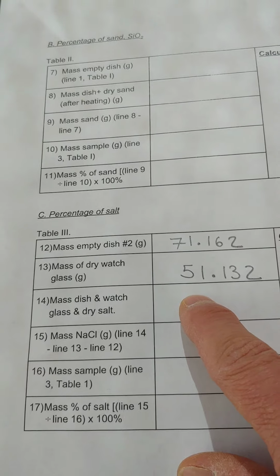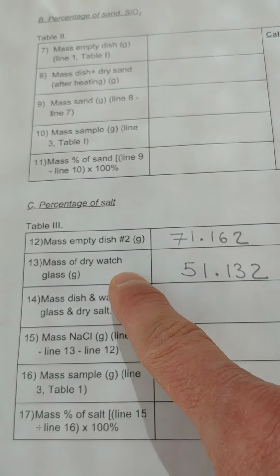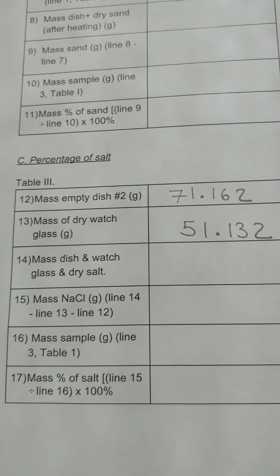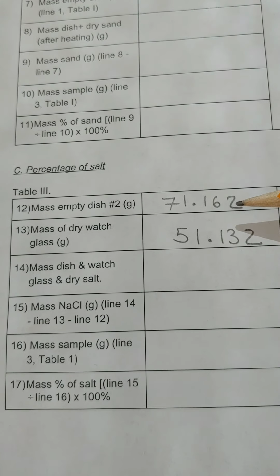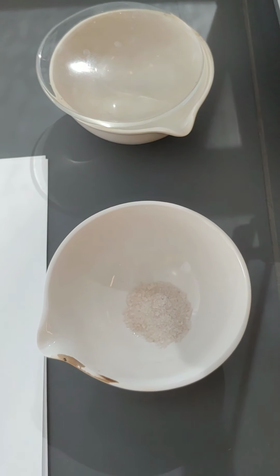When I evaporate the salt off, I want to make sure I have the watch glass on top, because this sample tends to splatter as it's evaporating, as the water starts to boil, and I don't want any of the salt being lost from the container. I want to make sure it all stays in, so essentially the watch glass just acts as a lid to keep all the sample inside. So I'm going to go ahead and start that process of adding the water, pouring it off into the second dish, and then repeating that process a couple times.